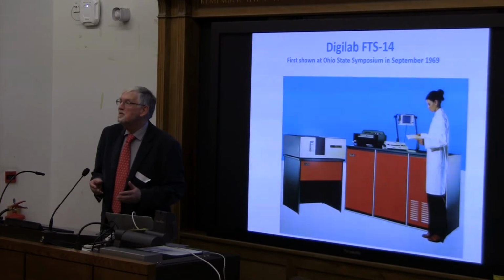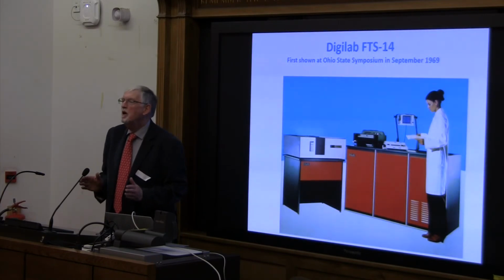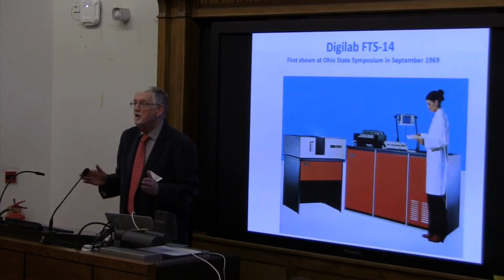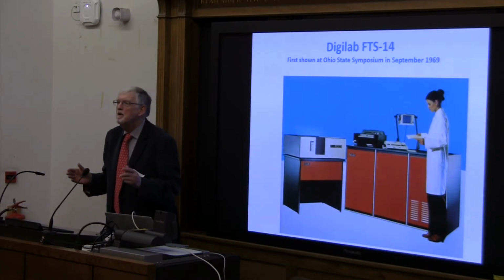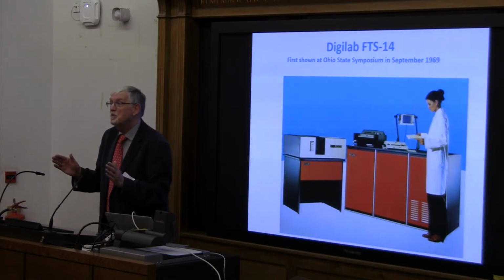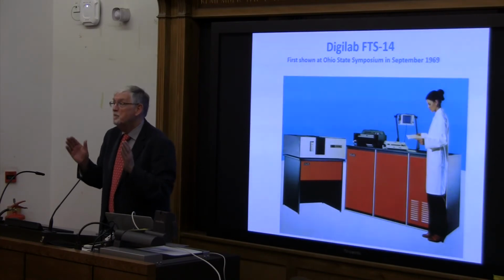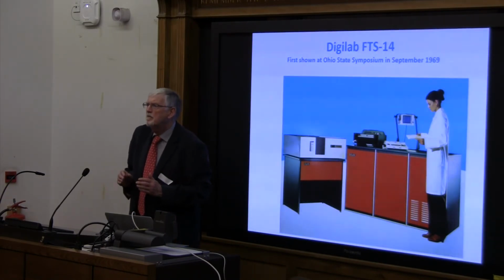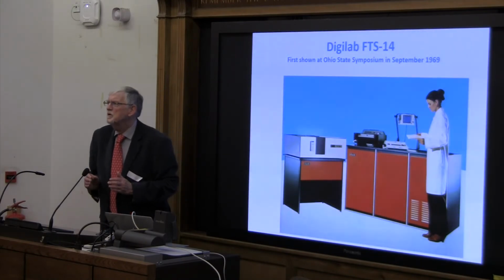The next day, the conference opened, and people were very impressed, except for one thing. The spectra were plotted from low wave number to high, which I thought was the logical way to print out a spectrum. But infrared spectroscopists at that time, and still, tend to look at spectra from high wave number to low. It started off with prism spectrometers, which went from short wavelength to long wavelength. When grating spectrometers came along with a linear wave number drive, they went from 4,000 to 400 or 200 reciprocal centimeters. That's how people learn to interpret spectra, by this sort of visual pattern recognition. So people looked at it and said, I really like the performance of that instrument, but I'd never buy one because the spectra come out the wrong way.